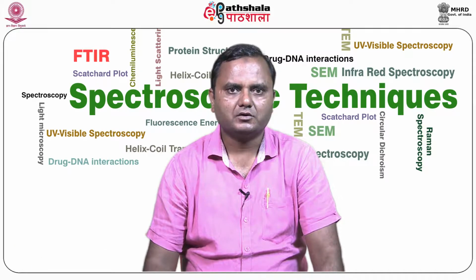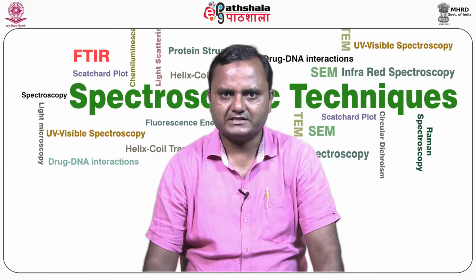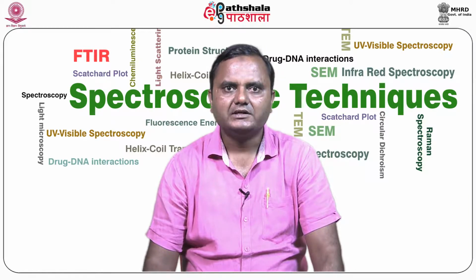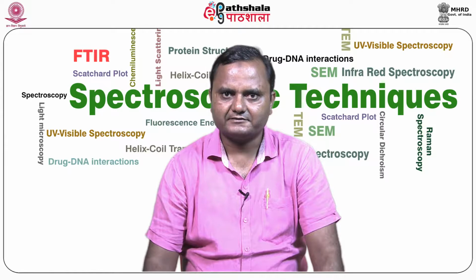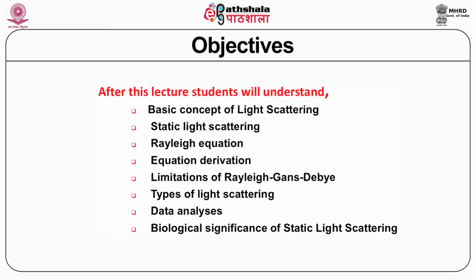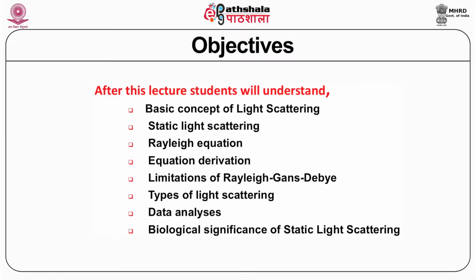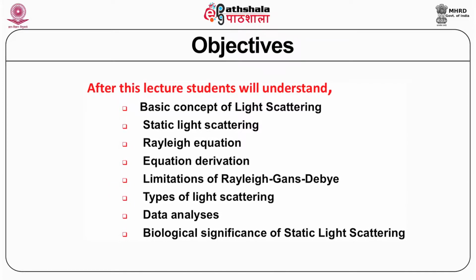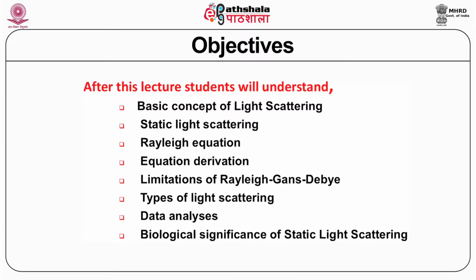Today I am going to talk on static light scattering under paper 10 of Biophysics. In this module, we are going to discuss topics related to static light scattering. In the module, we will talk about the first basic principle of static light scattering. Then we will discuss static light scattering in detail.